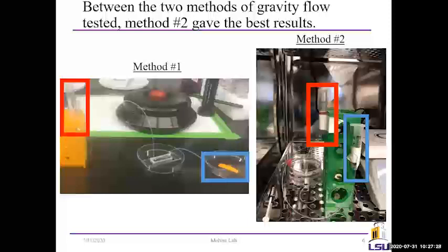I was able to create a system that was a low-cost replacement for this equipment using a test tube holder, syringes, and plastic tubing. In order for my trial to be a successful replacement, the system would need to be able to stand alone for 24 hours without human interaction and have a flow rate through the device of approximately 100 microliters an hour. The concept for my alternative flow device was that instead of being forced out of the syringe, media would flow downward through tubing in a gravity-induced flow.